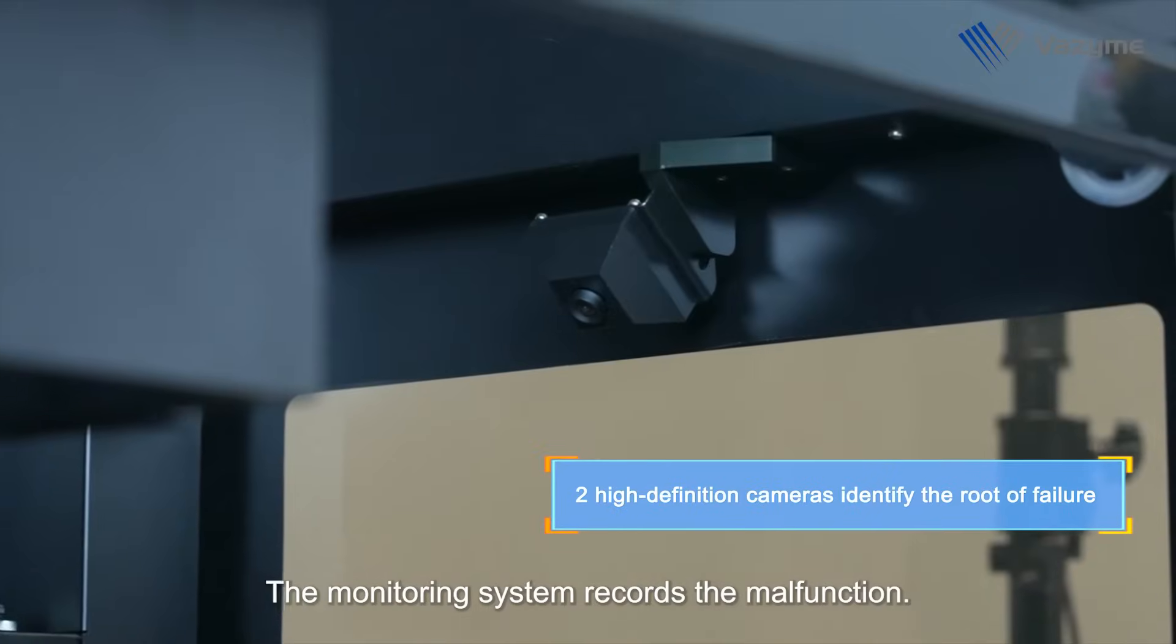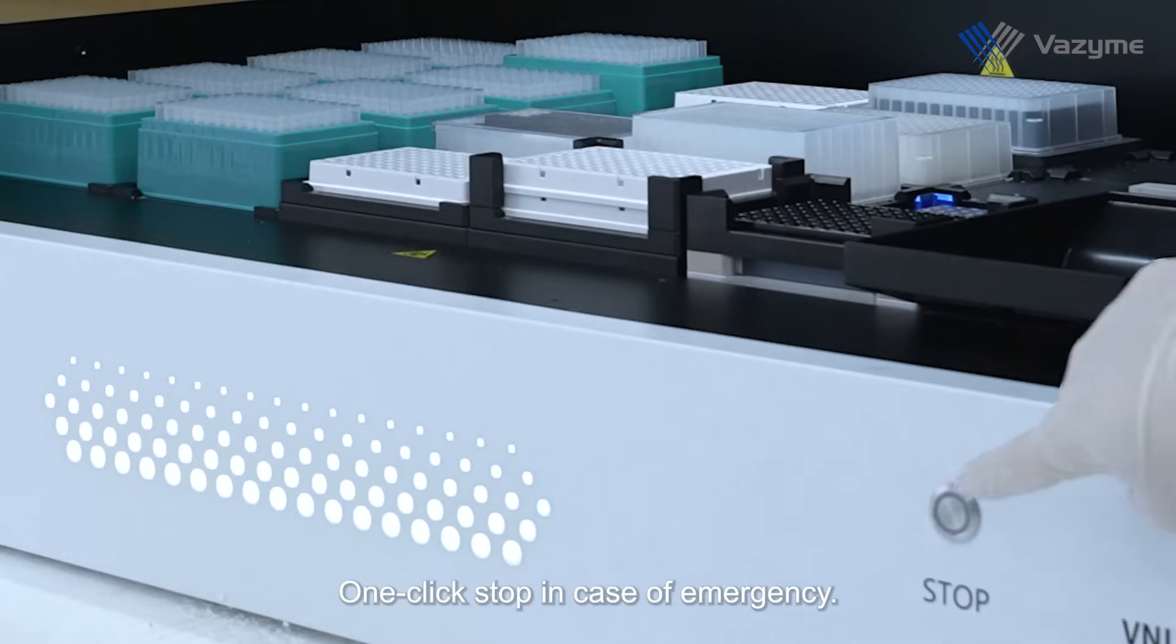The monitoring system records the malfunction. One click stop in case of emergency.